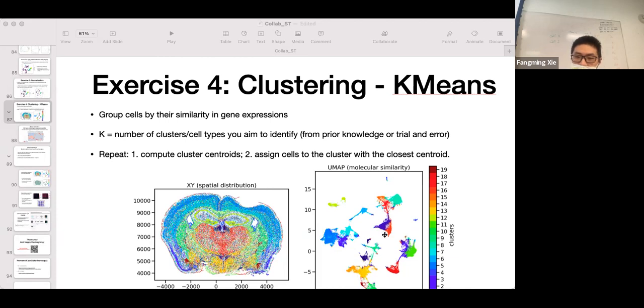And you identified clusters among those high dimensional gene space, which is represented by different colors, and you can map it back to the original spatial locations. And you can actually see that for some cells, some cell types, if you will, they anatomically form some specialized structures. So you can see this light blue cell types, which is probably located somewhere here, that goes along the outer range of this mouse brain. And here you have this sharp boundaries, that's hippocampus of mouse brain, that are similar to each other than their surroundings, and so on and so forth.